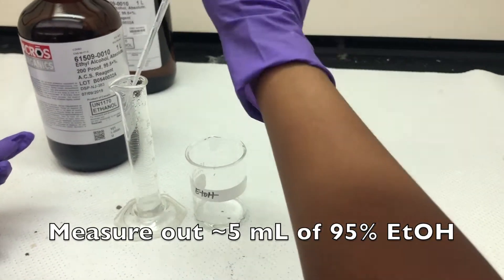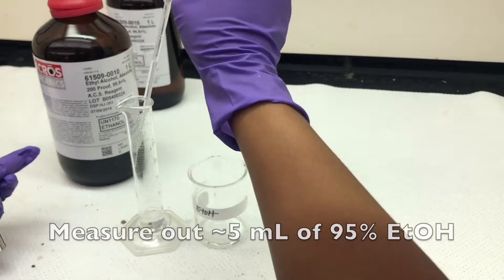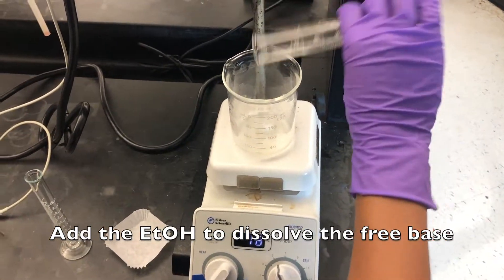Measure out approximately 5 milliliters of 95% ethanol. Add the ethanol to dissolve the free base.